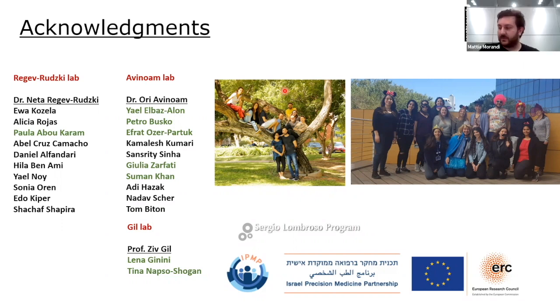Yeah, sure. So the 2D images are acquired at 200 kilovolts in a Arctica with a Falcon camera. Usually the resolution I use for acquisition is 0.4 nanometer. And with regard to dose, you cannot really measure it in one view, but let's say an exposure time of roughly 1 second. Then to present the images much clearer, what we do for the full image is a bandpass filter.